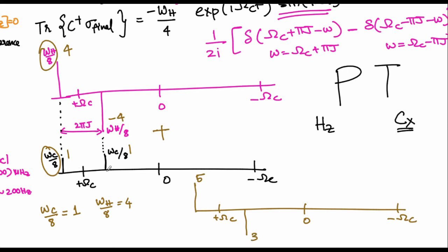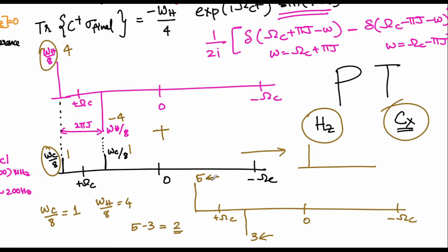Remember, previously you had a 1 is to 1 and you're boosting it at least by 3 times to get sensitivity enhancement. Of course, people who have done NMR would realize that, oh, why don't we decouple to get a better sensitivity? Unfortunately, if you decouple, your 5 and minus 3 will destructively interfere to get just a very small gain in the intensity. But overall, what you are able to realize is that you are able to transfer the polarization from proton to carbon to benefit in a signal boost that we end up achieving. We will see in just a few moments how this can still be exploited in order to get better sensitivity without the problem of having a plus and a negative resonance.